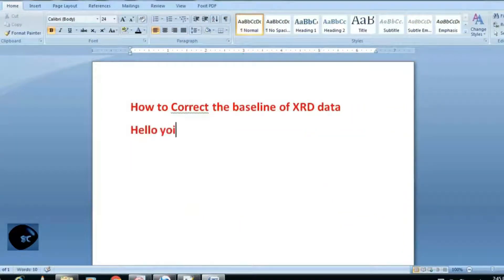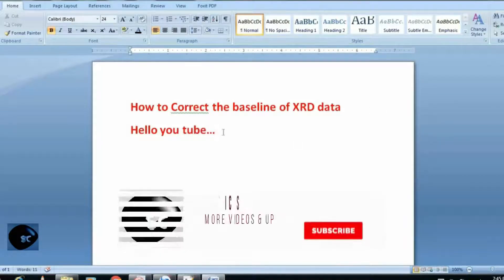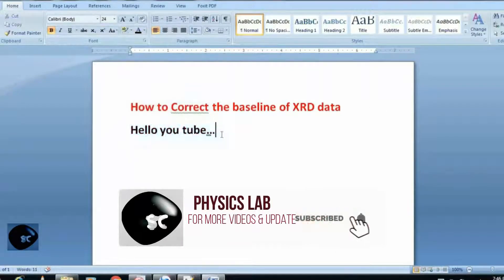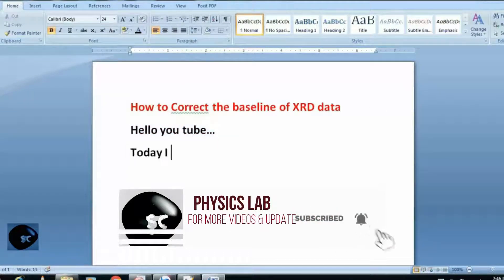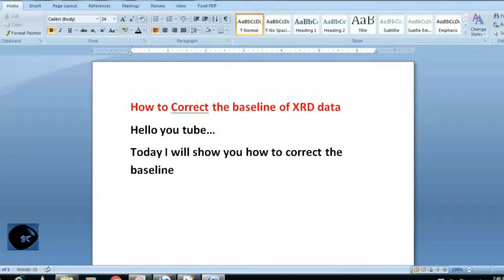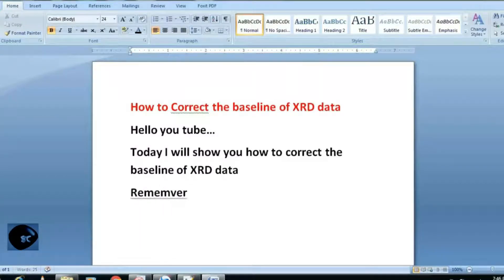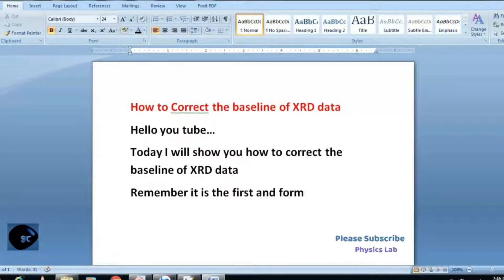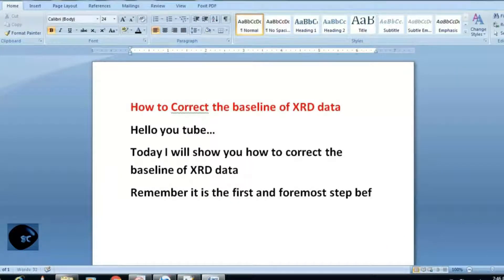In this tutorial, I will tell you how to correct the baseline of XRD data. Attention! This is the first and foremost step before doing any calculation involving XRD data.